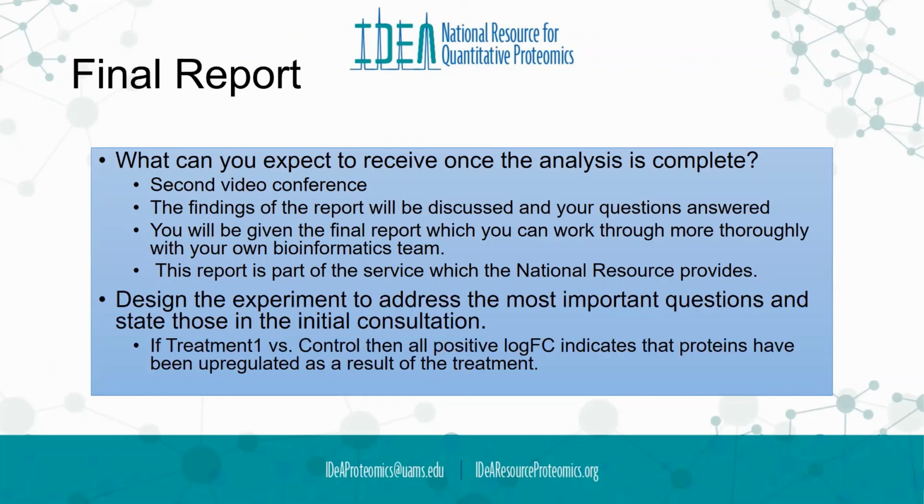It's important that you design the experiment to address the most important questions that you have and state those in the initial consultation. For instance, if you state that you want to compare treatment 1 versus the control, then when you get your final report, all the positive log fold changes will indicate that proteins have been upregulated as a result of the treatment.